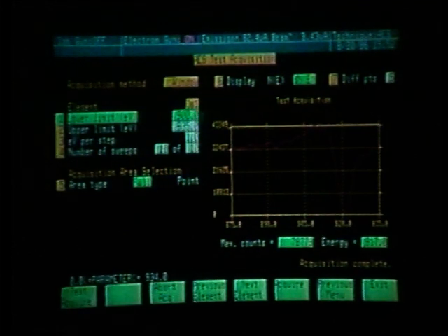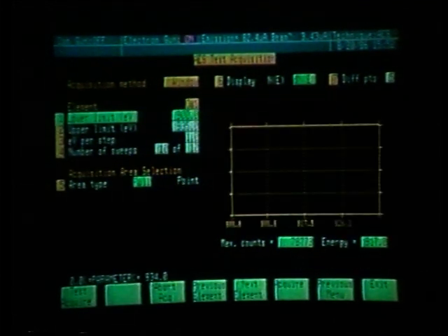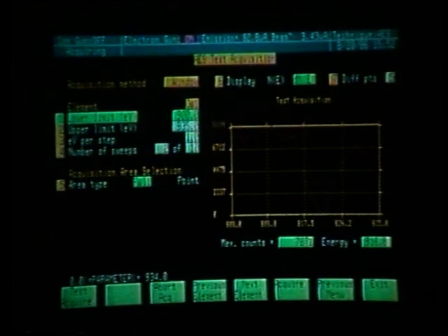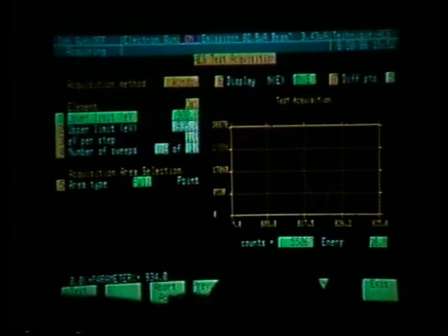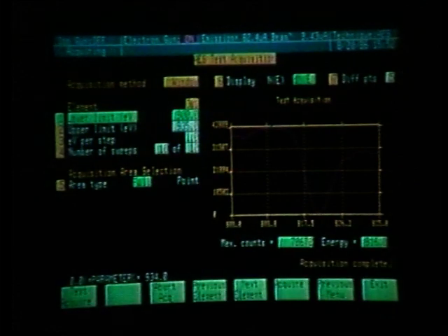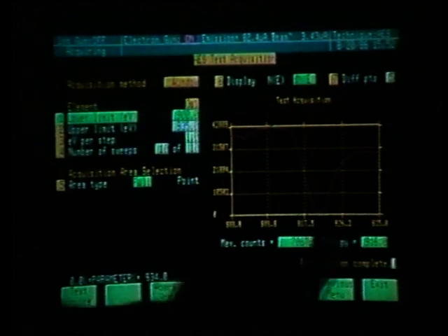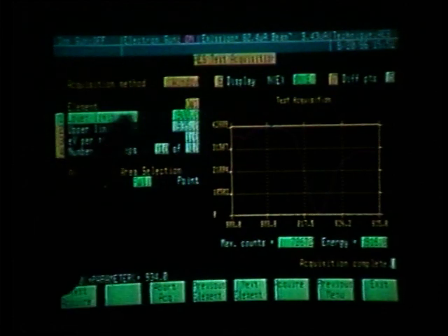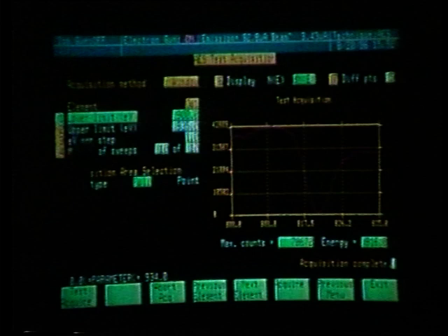Let's now reacquire and see if the peak fits within that energy window. We see that the peak fits nicely. We are not losing any information. And it will be quicker to analyze this window now than using the wider range. So again, we can use the test acquire to help us define our lower and upper limits so that we do not waste time during the profile.